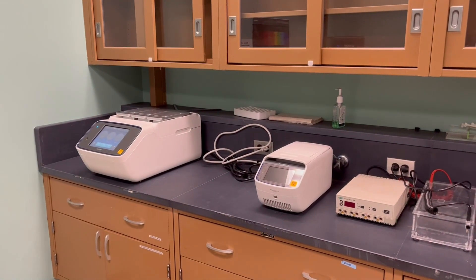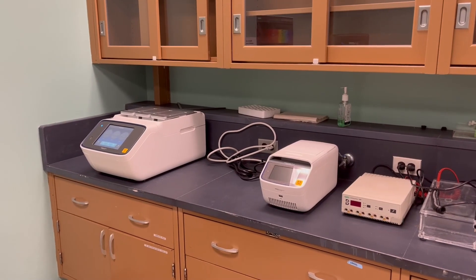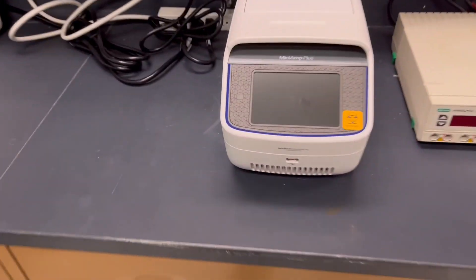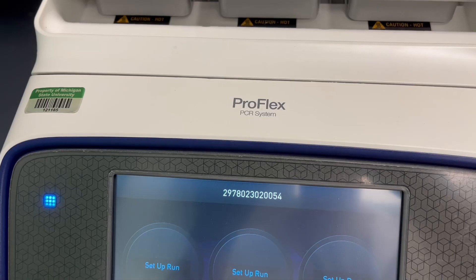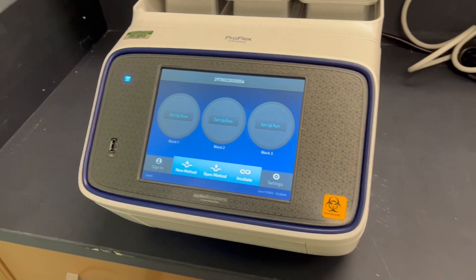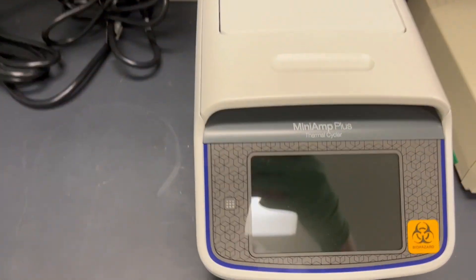Hello, we're here in the molecular and biochemistry core, and here we have a couple of new pieces of equipment that you may not be aware of: a MiniAmp thermal cycler and a ProFlex thermocycler PCR system. These are both great new pieces of equipment from Applied Biosystems by Thermo Fisher that we have available in the core to use.